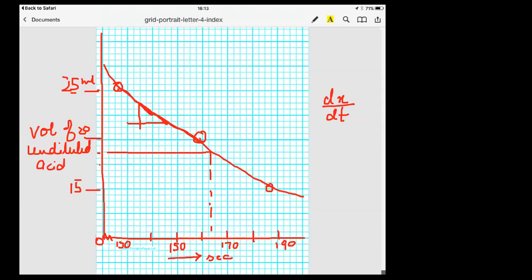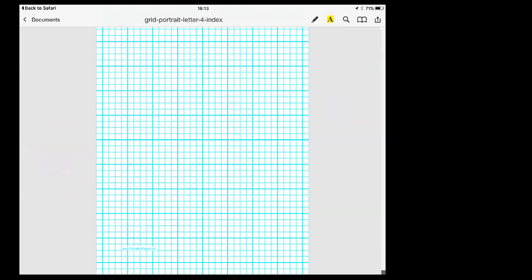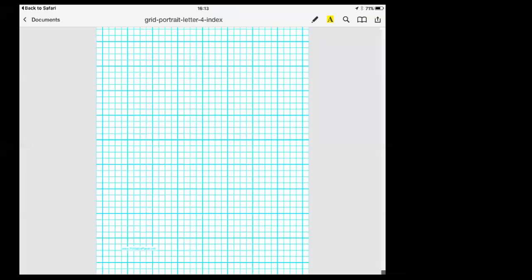Now this is a part of the question, and the next thing that you have to do in this case, I will show you. I'll remove this now, remove the graph. The next thing that you have to do in this case is answer the questions related to the experiment that you have done. So let me see now. I have to go to that slide.